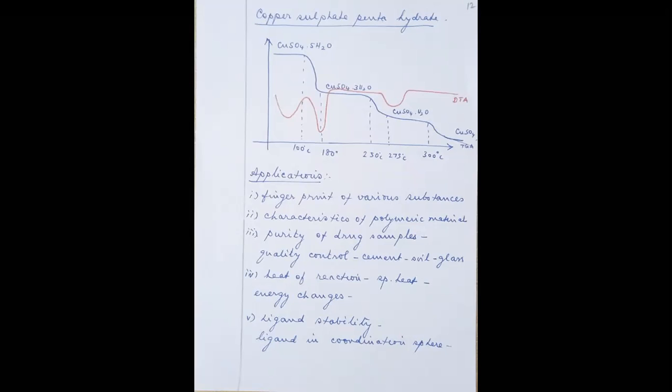The heat of reaction or a specific heat or energy changes accompanied with any process can be studied thoroughly and very accurately with the help of differential thermal analysis.